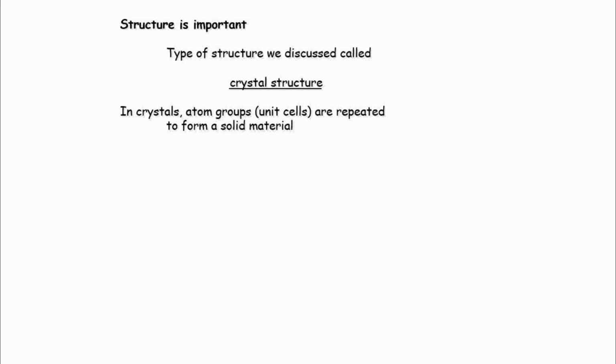Now this crystal is basically a solid material, a solid structure, but when I'm talking about an entire protein, it's a mix of all the atoms and molecules of that protein. What we have to do is narrow it down. Just imagine in your institute there may be, suppose, around 50 classrooms, together making up a building, which may be your entire campus, just for example, right? So if your entire institute building comprises 50 units, narrow it down to just one classroom where you are sitting right now. One classroom is basically one unit cell, which can be studied or focused on individually, and the same thing can be repeated for all 50 classrooms one by one.